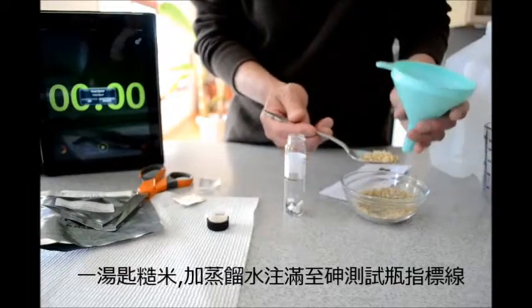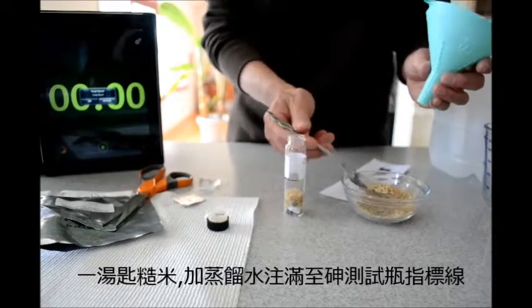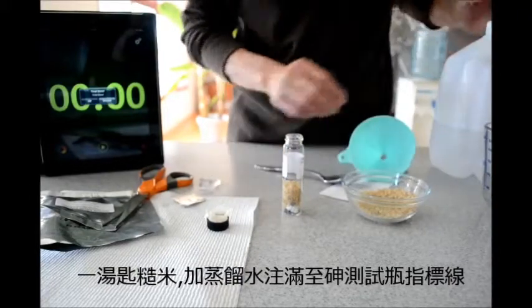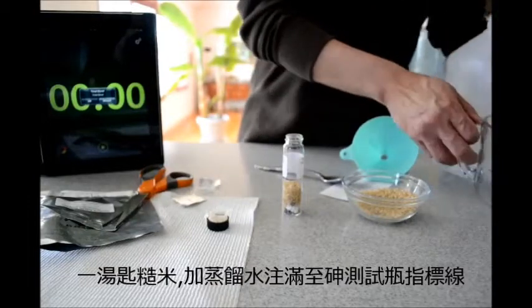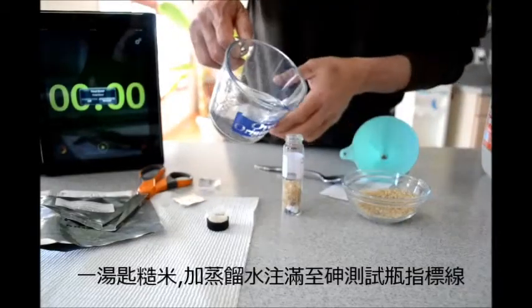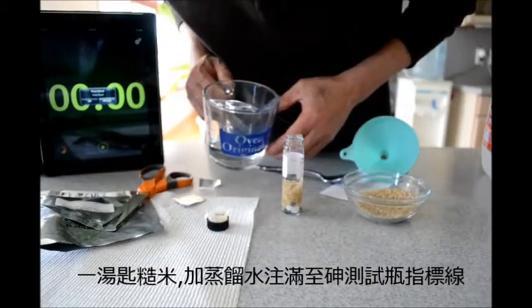It doesn't have to be exact — about a tablespoon should do it, just a little bit more. This is about a tablespoon. Then I need to put in the equivalent amount of distilled water and fill it to the mark here.